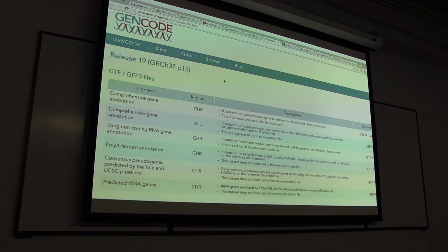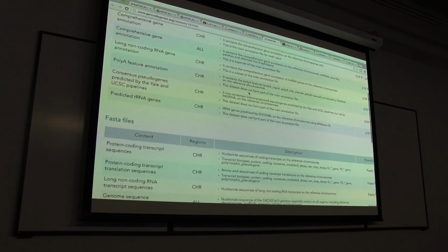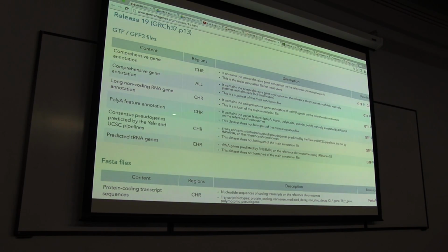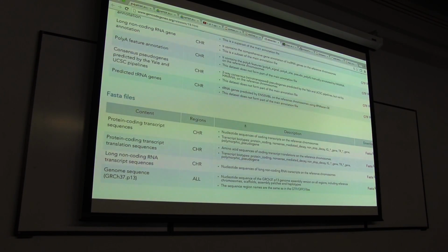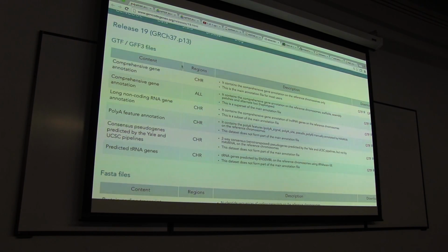The link that I provided actually takes you a little bit into GenCode. You'll notice that I'm already on release 19, so this is chromosome build HG19, and I'm in the human genome. If you just go to the GenCode website, you can navigate through to get in here. What you'll see is a bunch of different files available for you. They also have FASTA files here. This would have been another place where we could get all of the chromosome FASTA files, but we used Genome Browser.